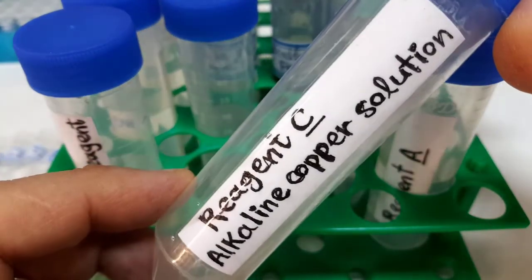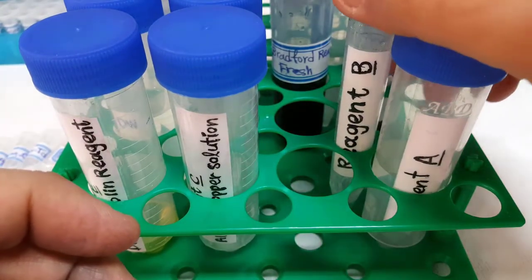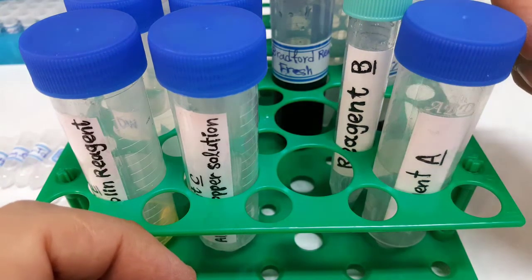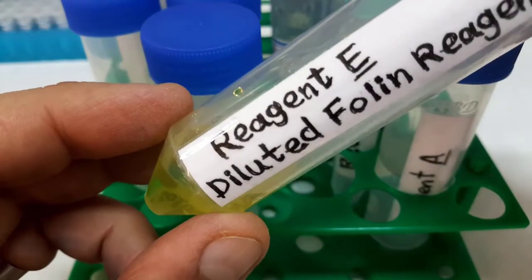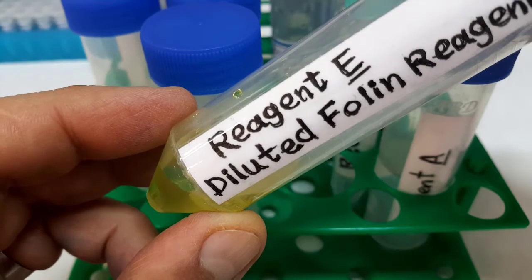Reagent C is alkaline copper solution, which is prepared by mixing reagent A with reagent B in a 50:1 volume by volume ratio. Discard after 1 day. Reagent E is Folin reagent diluted in 1:1 volume by volume ratio with distilled water.